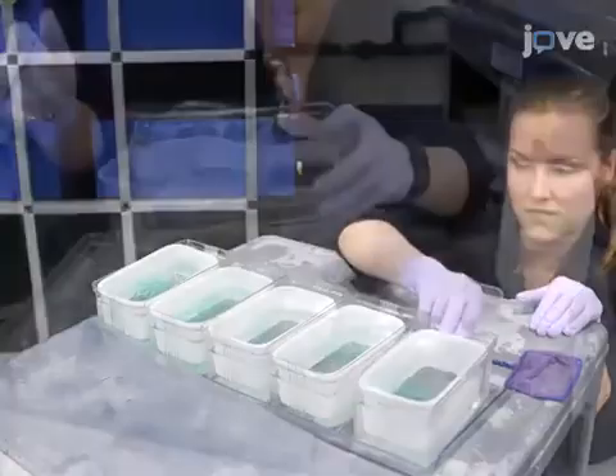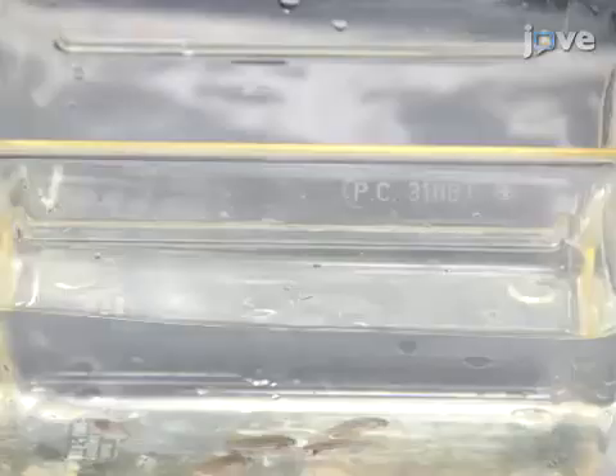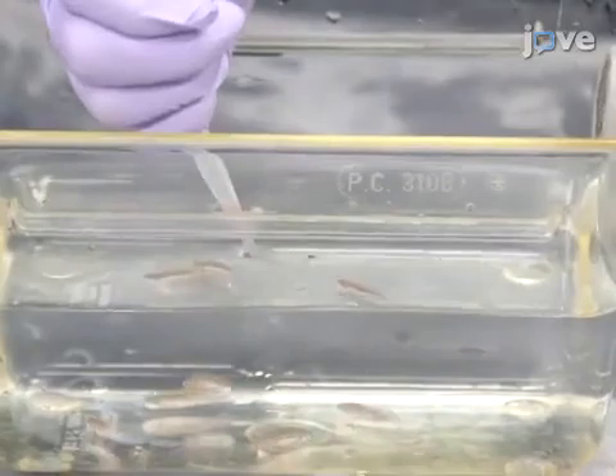After allowing the fish to mate through the following afternoon, use a fishnet to separate the females that yield eggs during mating and place them into a separate tank. Feed these females twice daily with a food mixture containing approximately an equal amount of brine shrimp and fish food flakes.